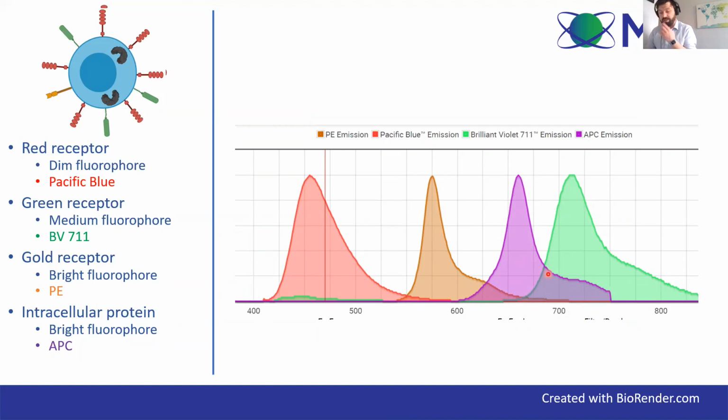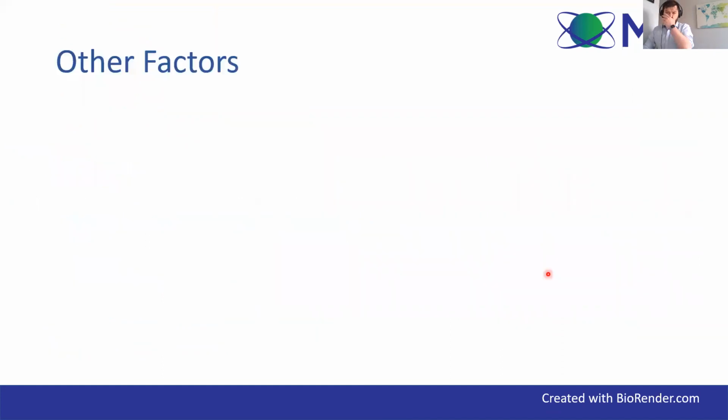You're not going to be able to avoid some level of spillover, but that's a pretty good panel. It gives us everything we need. So just some other factors before we finish up that you need to think about when designing a multicolor panel.